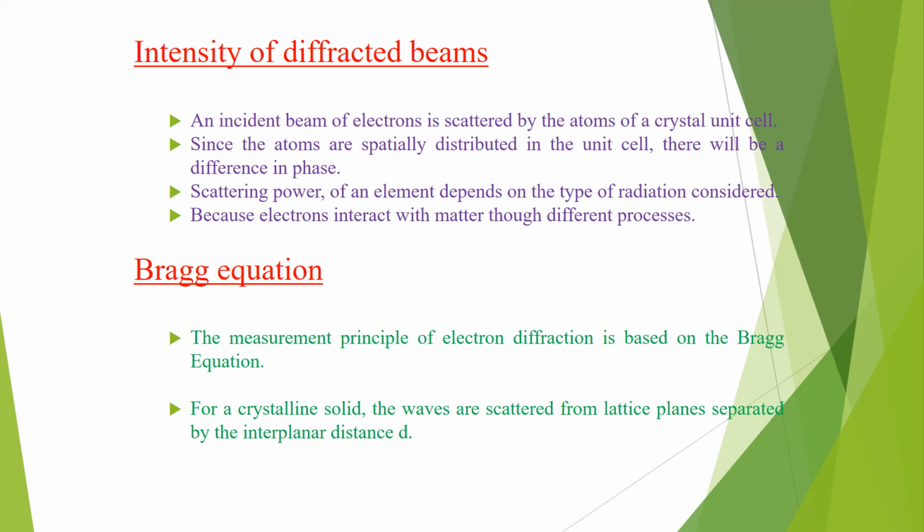Bragg equation is the most basic equation in crystallography, and the measurement principle of electron diffraction is based on this equation.